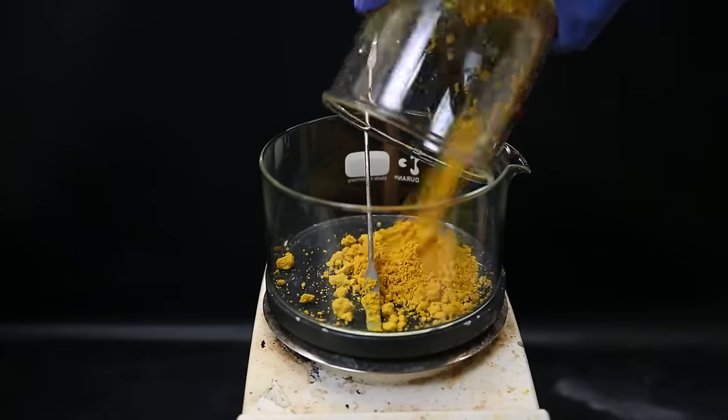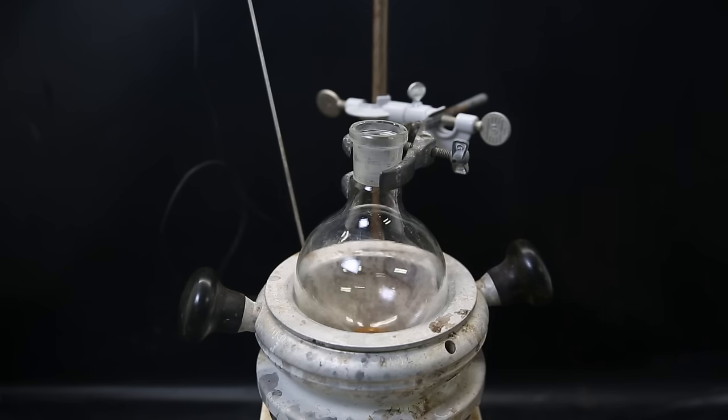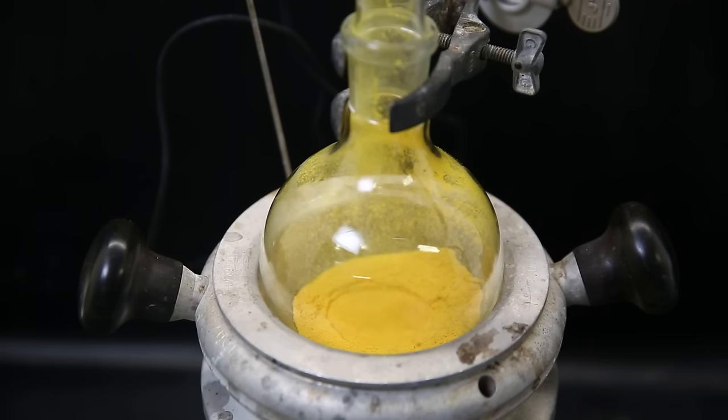I then dump it all into a crystallizing dish, but it's still very wet from all the water. So I move it all to a flask in a heating mantle, and start heating it lightly while pulling a strong vacuum. This will pull out all of the remaining water. When it is completely dry, it becomes a satisfying free-flowing powder.